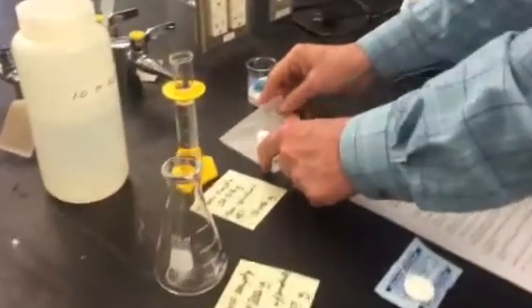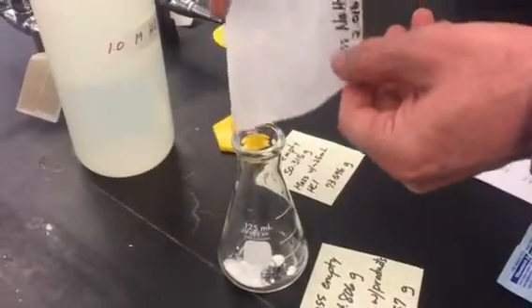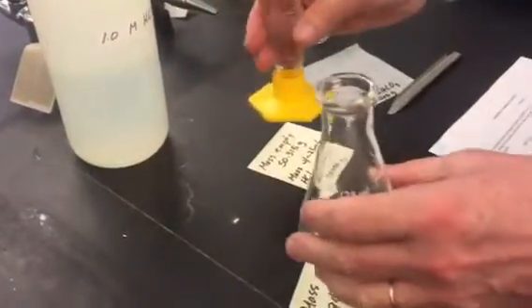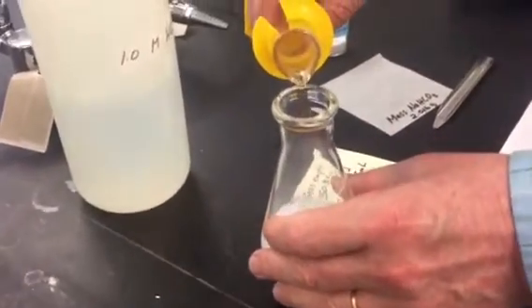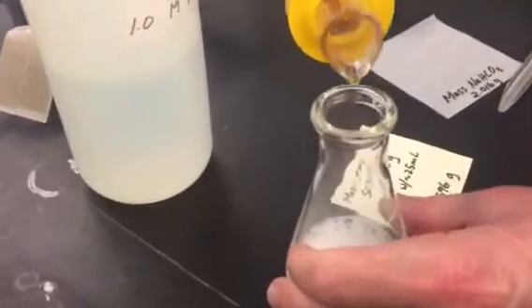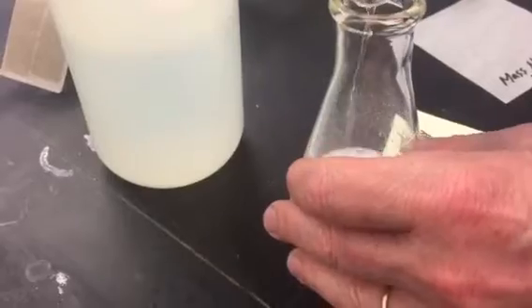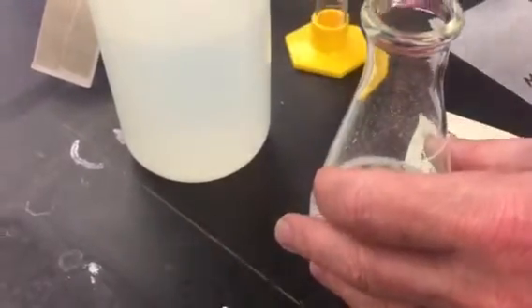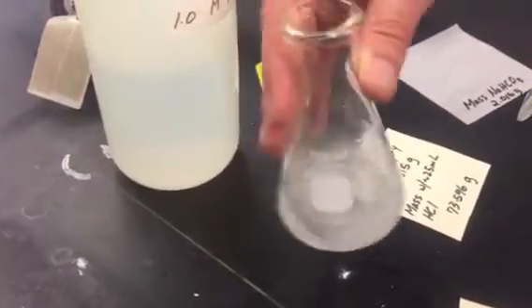So basically the procedure after you've got all your mass data is to put the solid sodium hydrogen carbonate into your massed empty flask, and then carefully pour the acid into the flask, making sure that you don't overwhelm the flask and send reaction mixture out the top. You're going to swirl to try and get all of the solid dissolved and reacted.